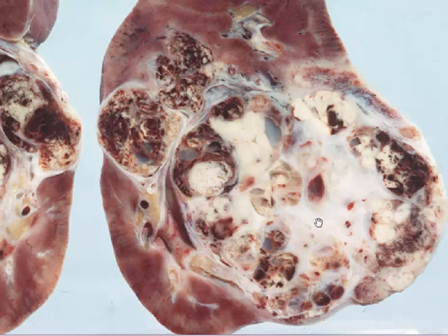The connective tissue is hard and tough. That hard, tough connective tissue, it's important to understand, is not the tumour. It's the body's response to the tumour. The tumour itself is made of quite soft, squishy, lipid-laden cells.